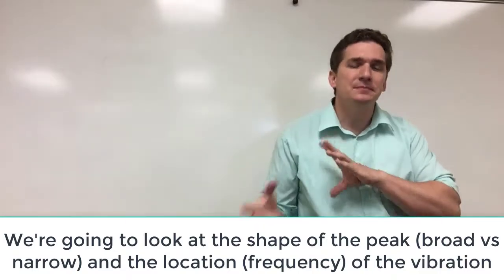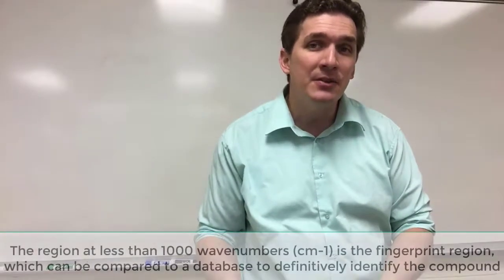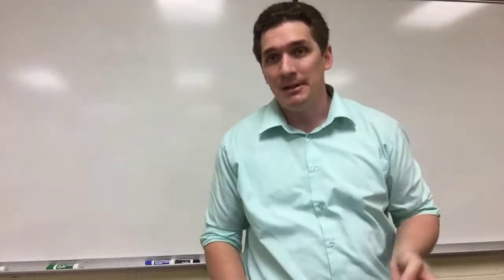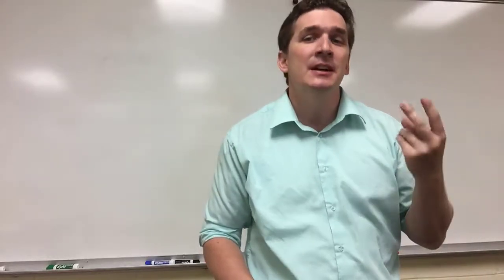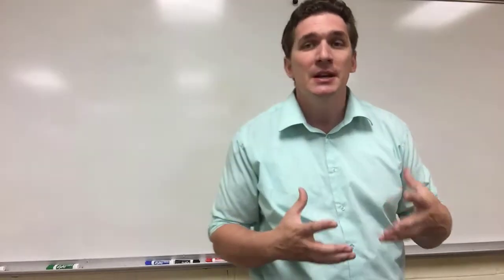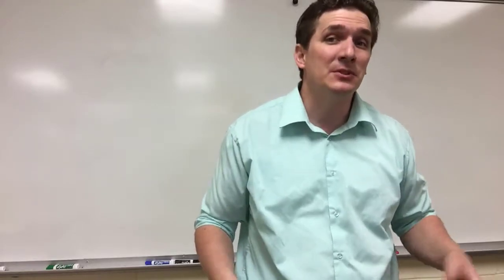Now, full disclosure, the region below about 1500 wavenumbers, inverse centimeters, is what's referred to as the fingerprint region. If you had a database, you could actually compare that region to known spectra and say, this is the compound I have, because typically that region is unique to a given compound. But we are not going to do that for two reasons. One, we do not have access to these databases. The second, and far more practical, is that if you're working with an unknown, it's good to understand how this technique works. If you don't have a database to compare to, or your compound isn't in the database, not being able to analyze the rest of that spectrum puts you at a severe disadvantage.